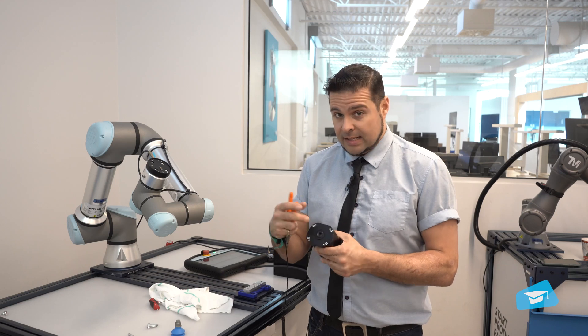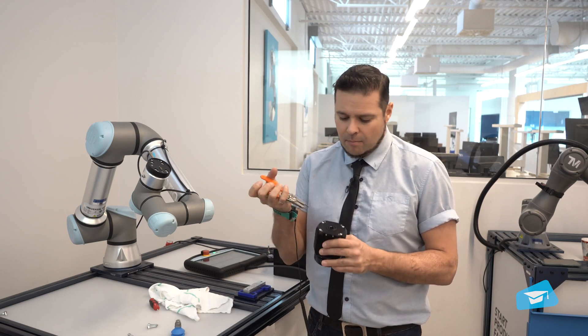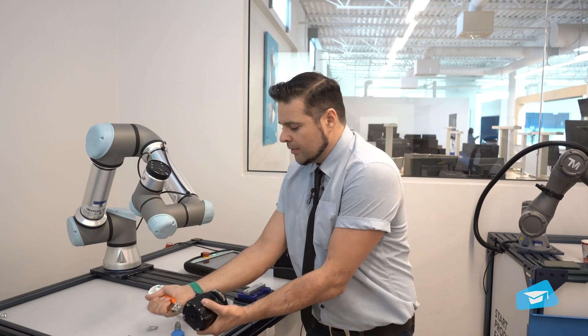If you see that it needs cleaning or replacement, you'll want to use a set of snap ring pliers and remove the snap ring to have access to the filter.